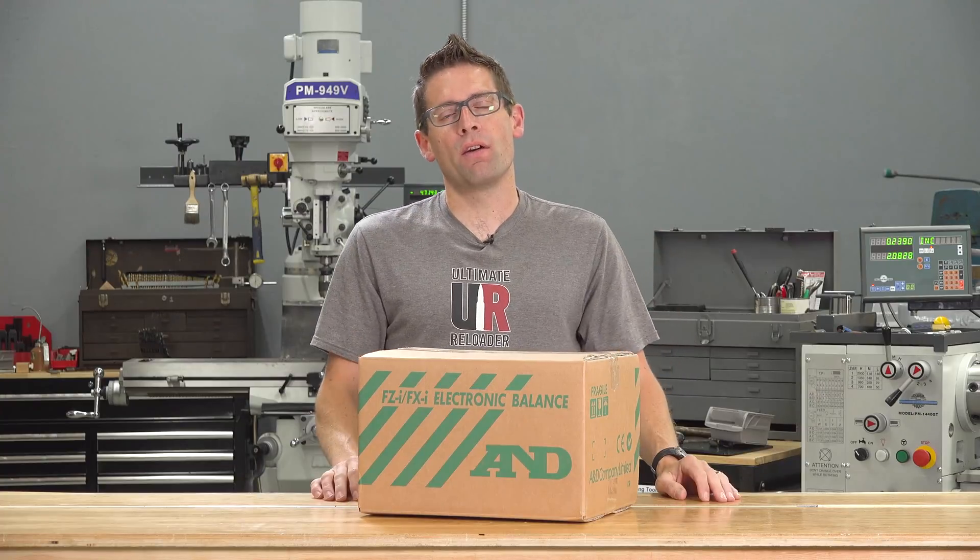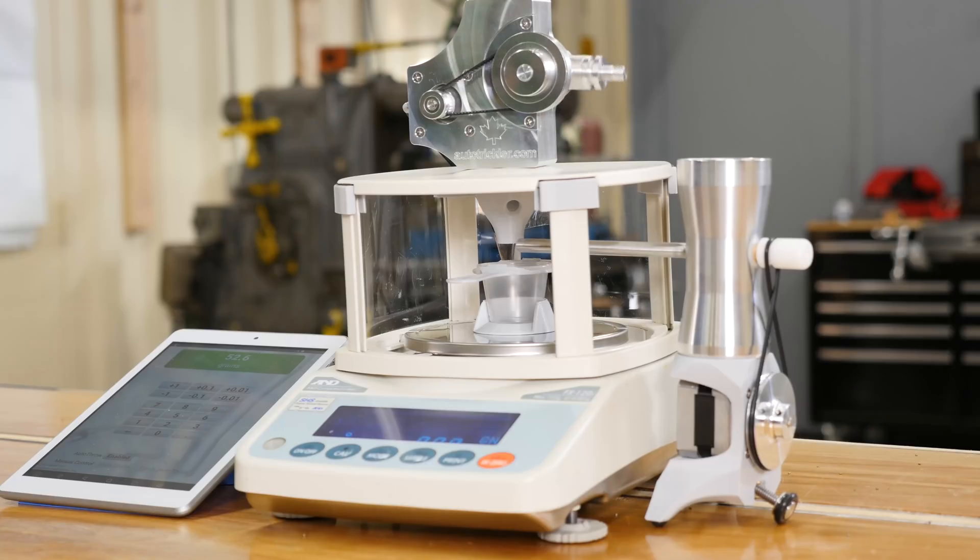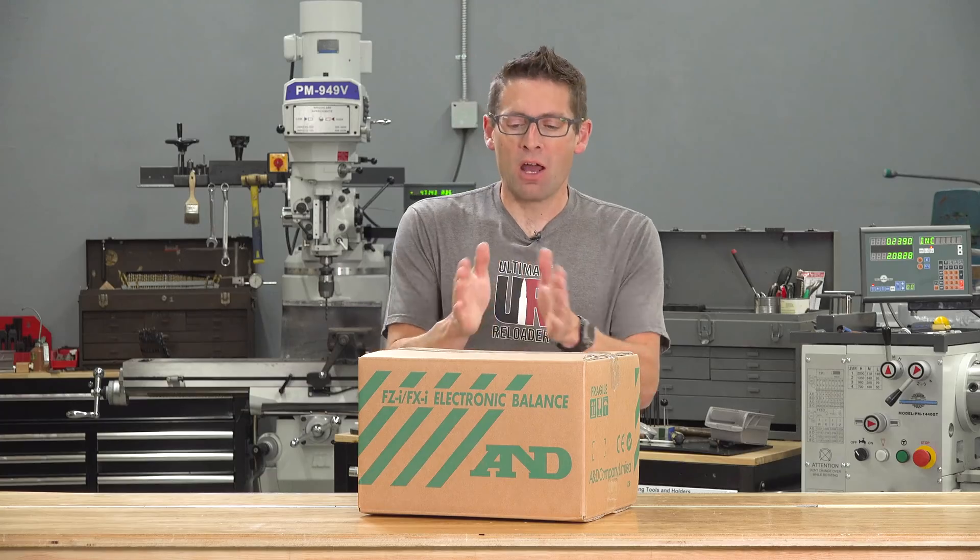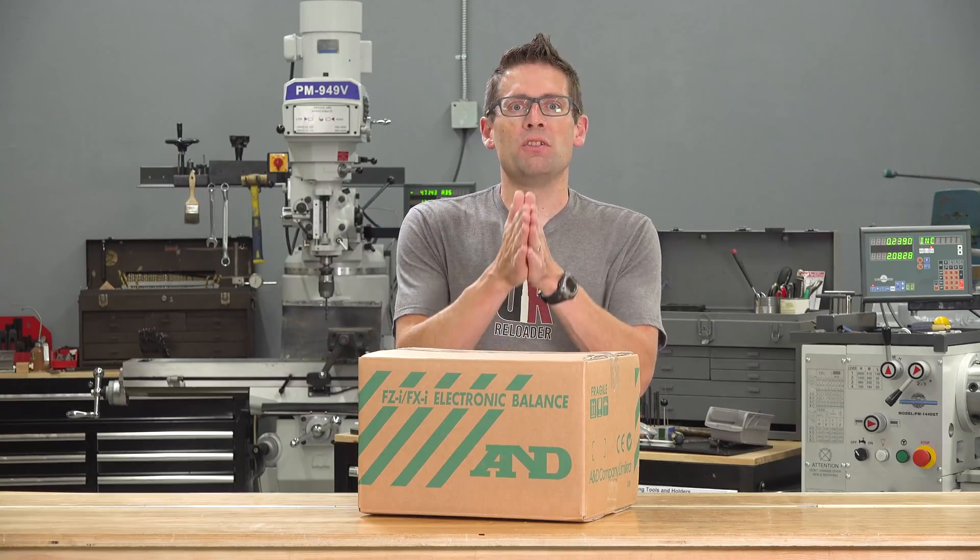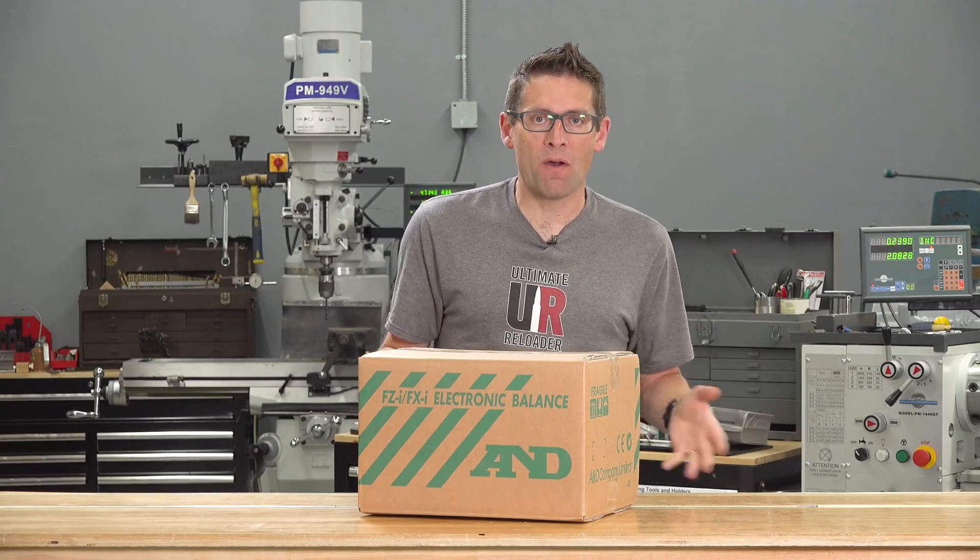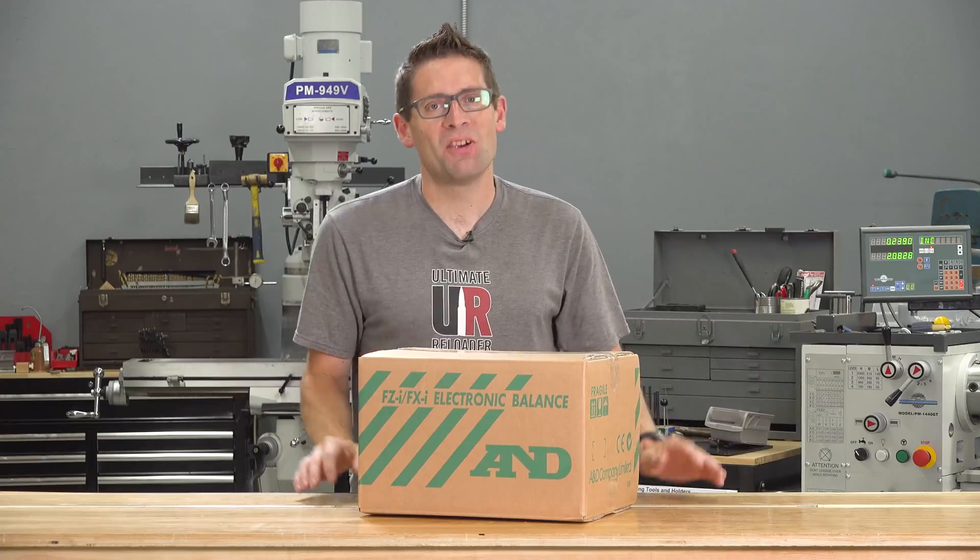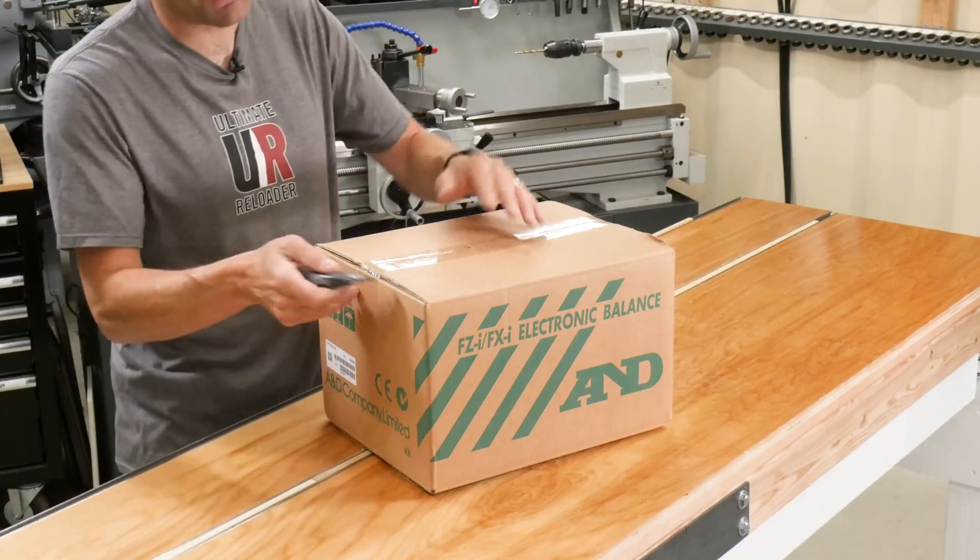And it's also at the core of the AutoTrickler system from Adam McDonald, which I've recently talked about and will be featuring in a bunch of upcoming videos. So here's what we're going to do. We're going to unbox the scale, see what's included, do a setup and a quick demo, and then I'll be following that up with a bunch of other cool videos. So let's get the box open.